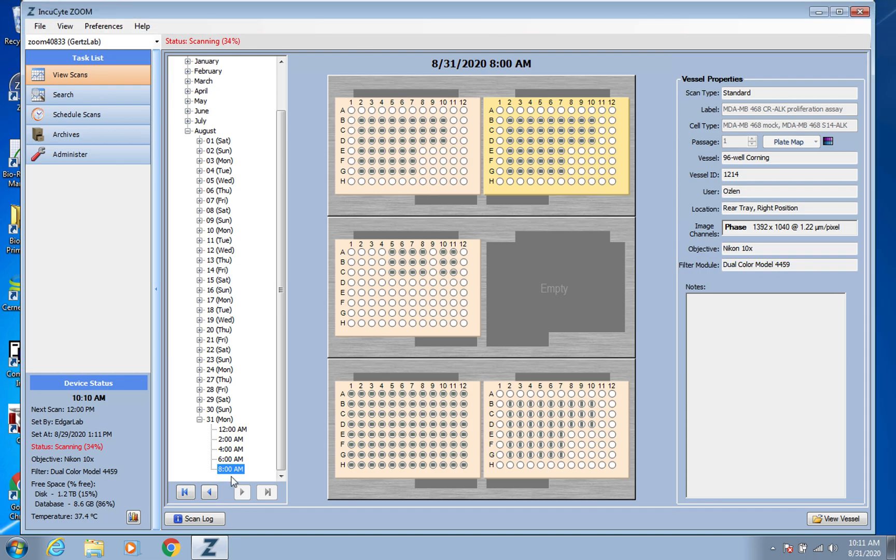Hello, this is Christina Rodriguez, and this video is going to be about how to create a processing definition.